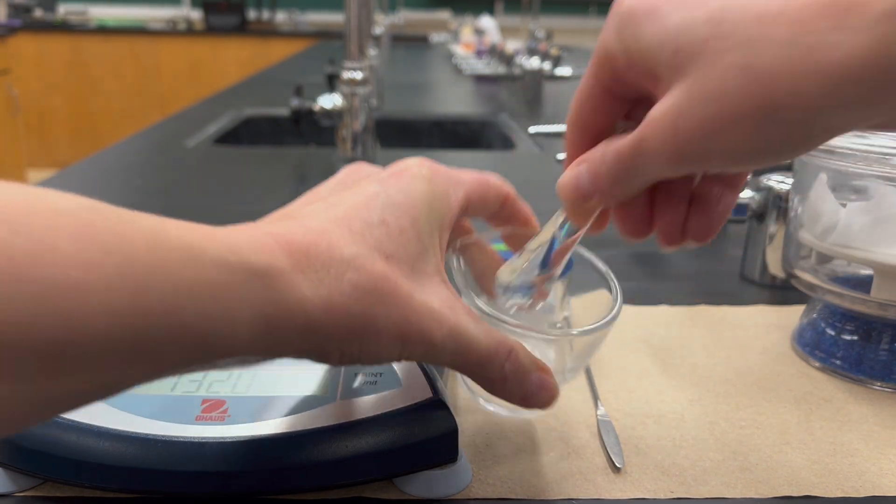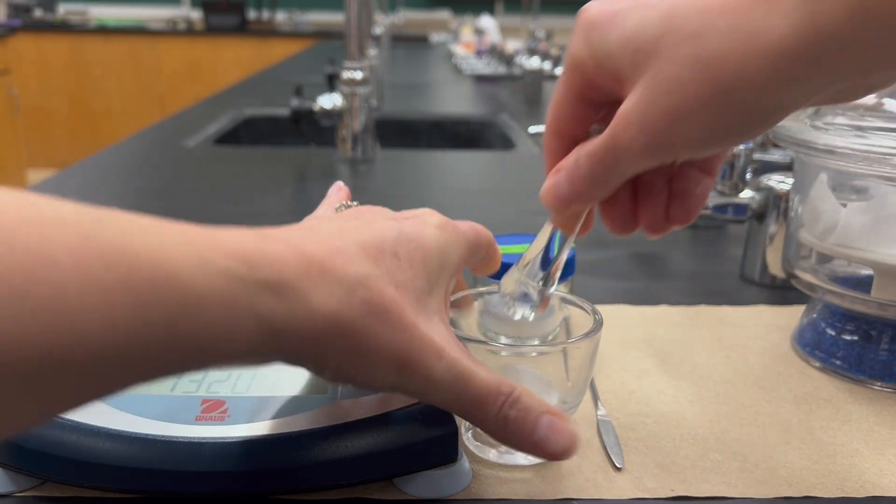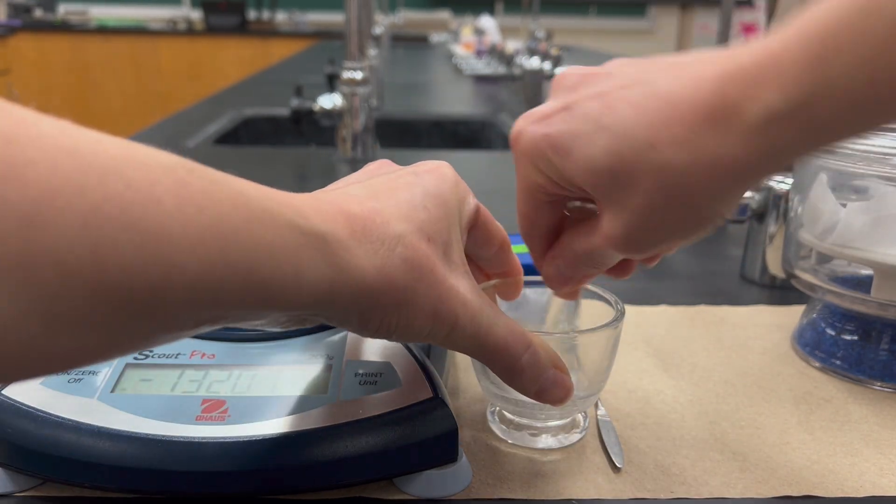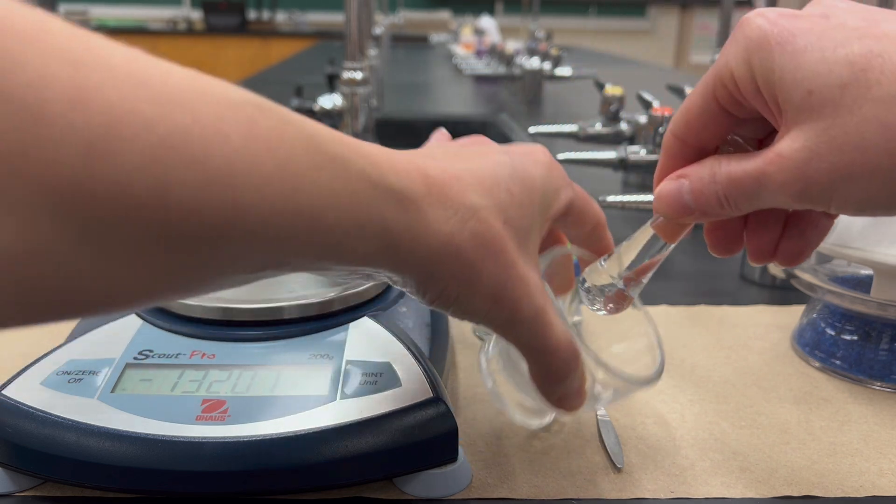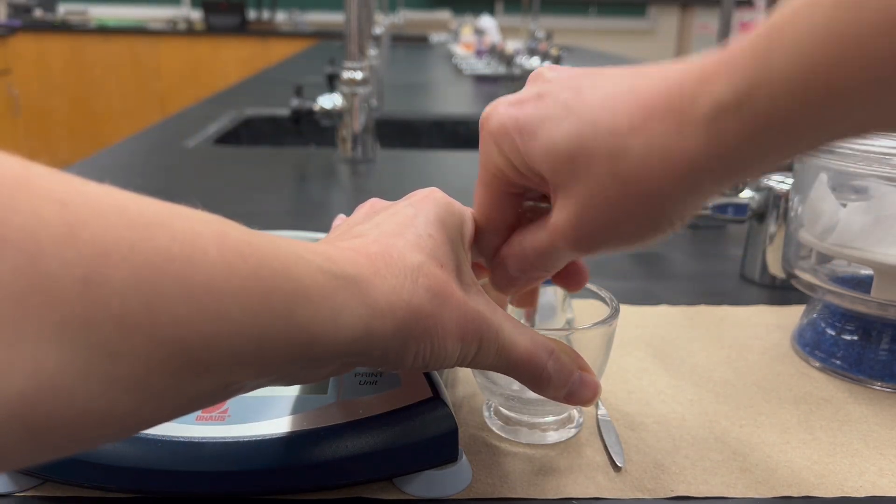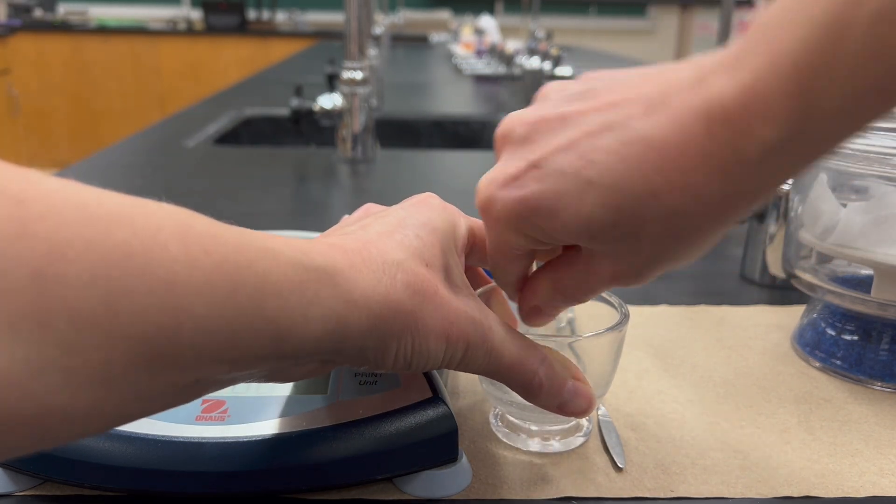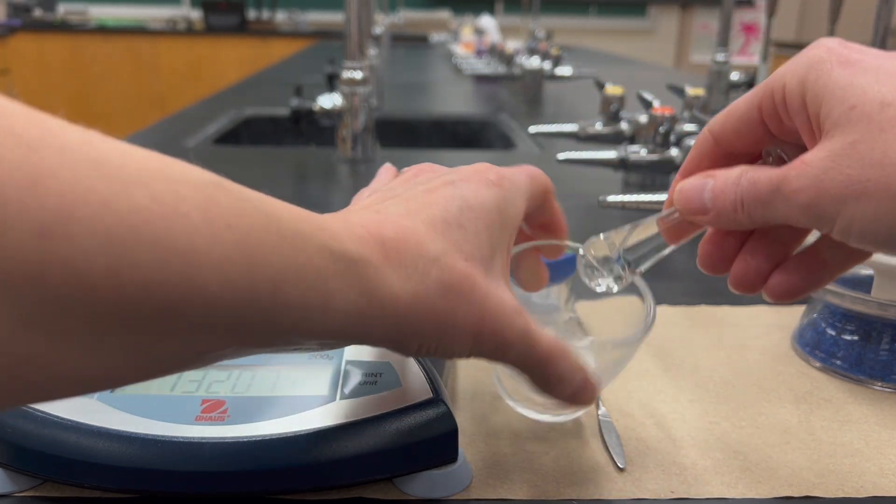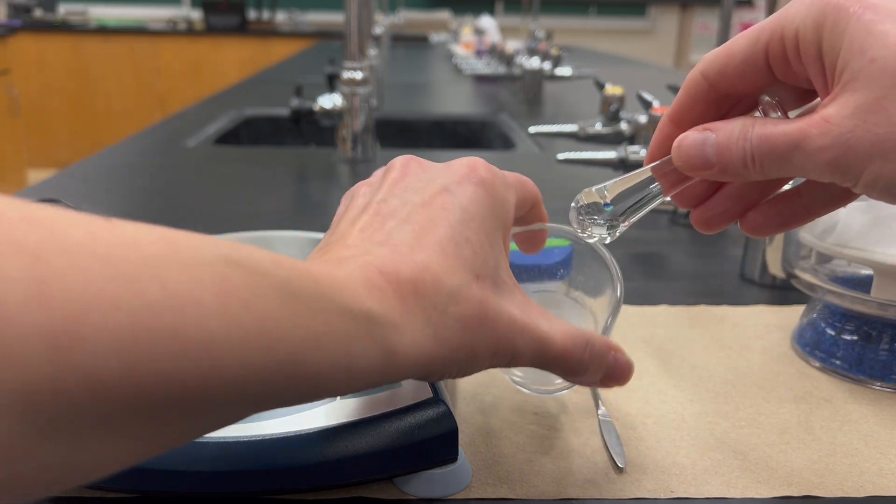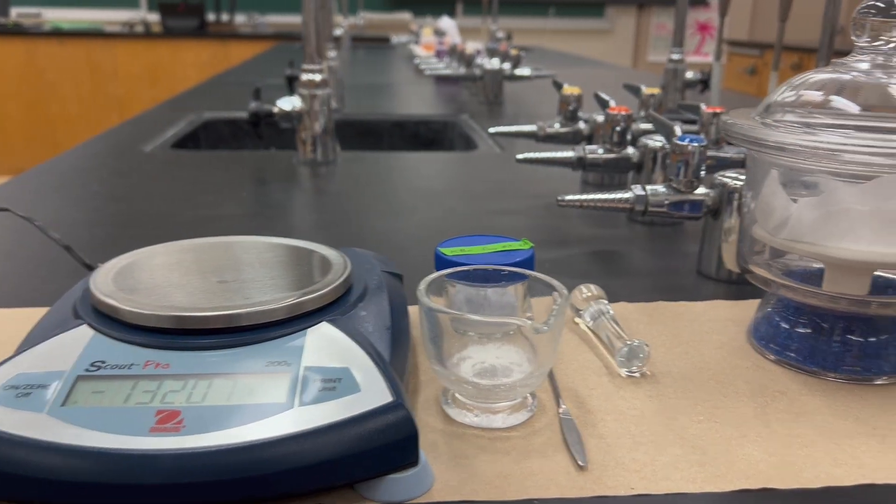Then you're going to use the pestle and grind this stuff together, and you want to create a really fine powder. You do want to make sure that you mix the sample in with the KBR, so periodically you want to tap the mortar and make sure it dislodges; otherwise, you won't actually be grinding the sample together. Make that a nice powder and then you're ready to move on.